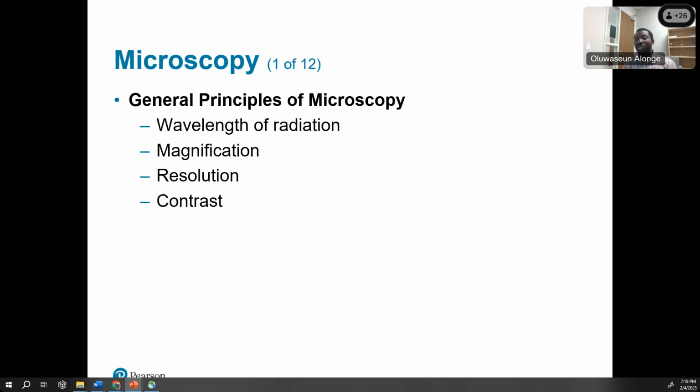Now, you notice that when you go into the lab, most of the time you see a slide that is either pink, purple, sometimes you see blue. And when my students see any other color that is not pink and purple, they seem to be like, we can't relate with this image. And I keep trying to tell them that no, the issue is not about the color. Just like if I come here with different clothes today, it doesn't mean you are not going to know it's me. The issue is about the structure itself, not the color.